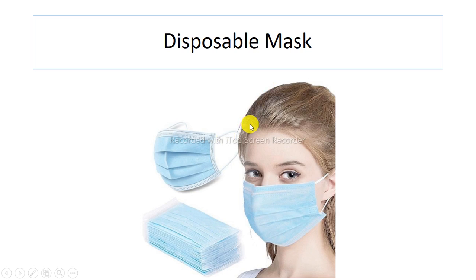Then disposable masks. Due to the corona pandemic, we have seen that masks have many usages. In various conditions we can use them, but mainly because we want to protect ourselves from fumes, gases, particles, viruses, any bacteriological things, or so many things.